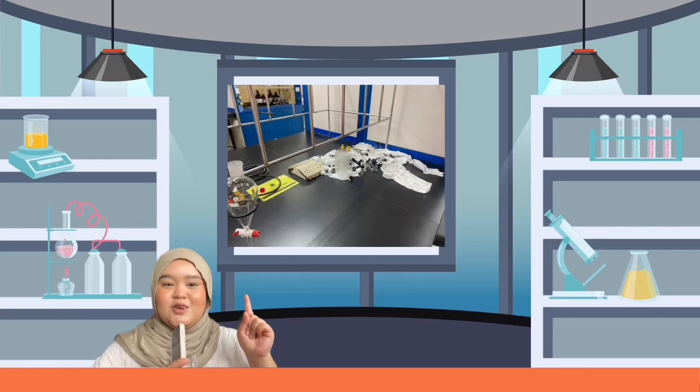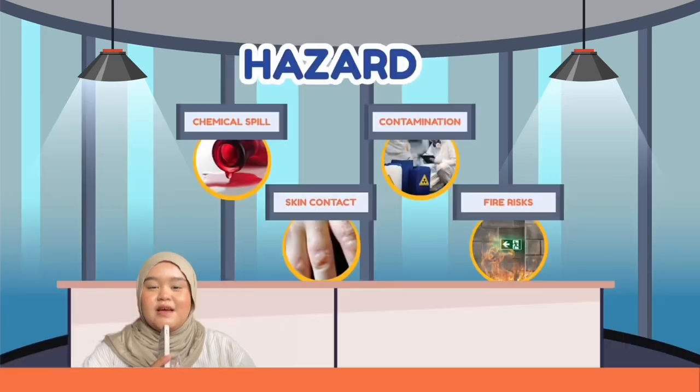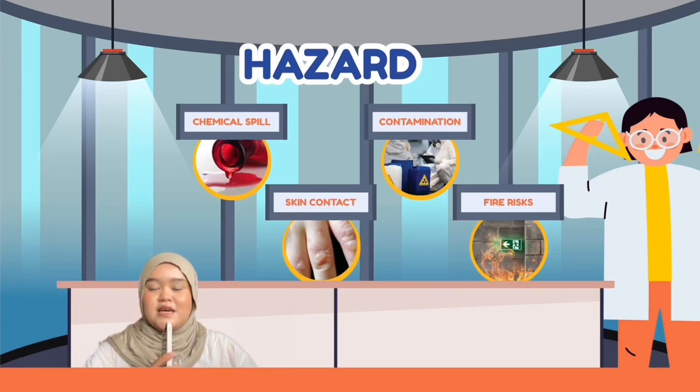This image shows an example of poor laboratory housekeeping. We can see chemical containers left on the bench, used tips placed on tissue paper, and chemical residues on the work surface. This situation can lead to several hazards such as chemical spills, skin contact, contamination, or even fire risk. Poor housekeeping also increases the chance of accidents, especially in shared laboratory spaces.